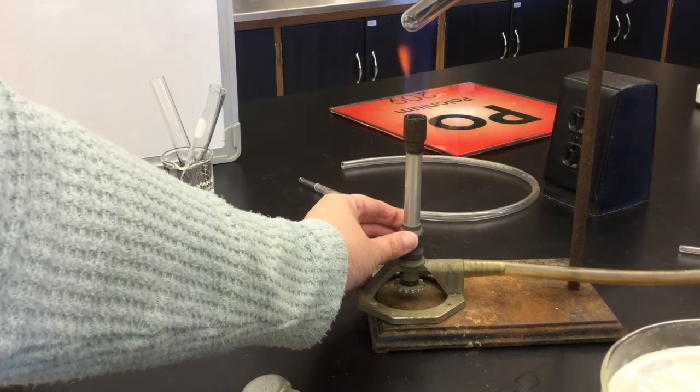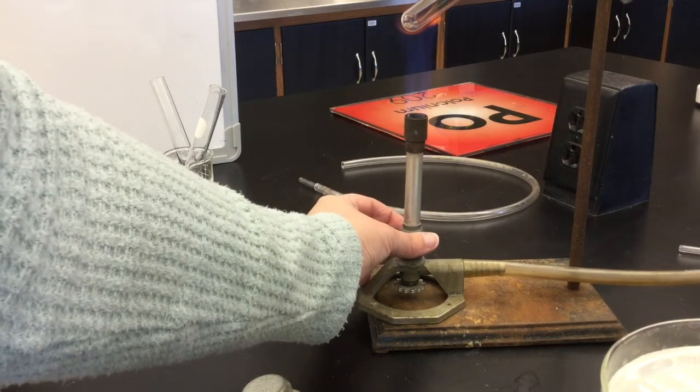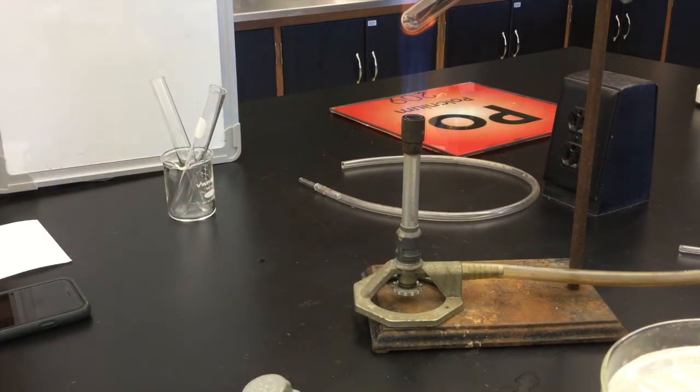So in adjusting these two, you want to see an inner light blue cone, and the tip of that light blue cone should come just to your test tube. Again, you're going to heat for about a minute, but if you continue to see bubble formation, continue to allow the heating to occur until there have been no new bubbles for at least 10 seconds.